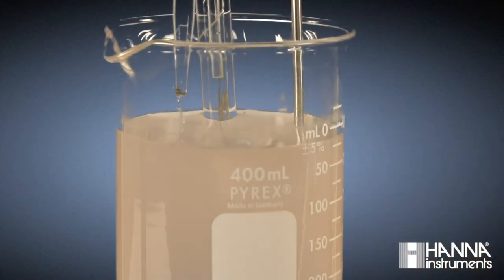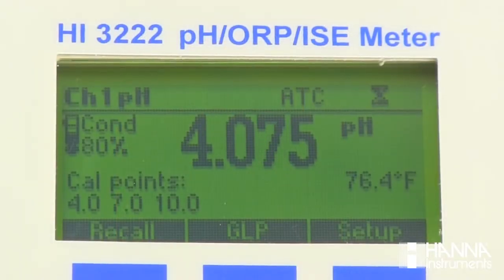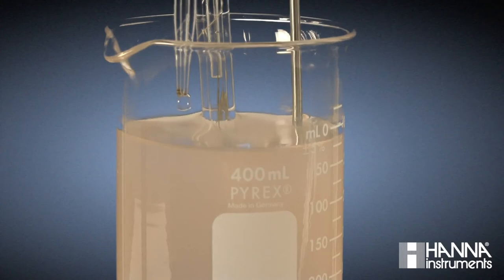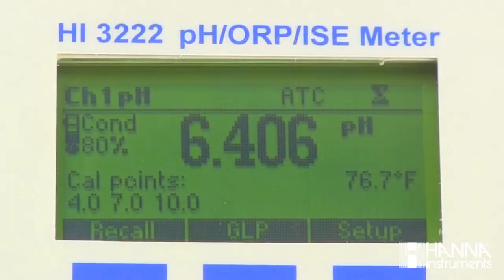Initially, as we add our titrant, we see that the solution remains colorless with each titrant dose and our pH is changing relatively slowly, only in the hundredths for every drop added. As we get closer to the endpoint, we're seeing that the colors begin to flash in the solution, but the color change is not sustained, indicating that we aren't yet at the endpoint.